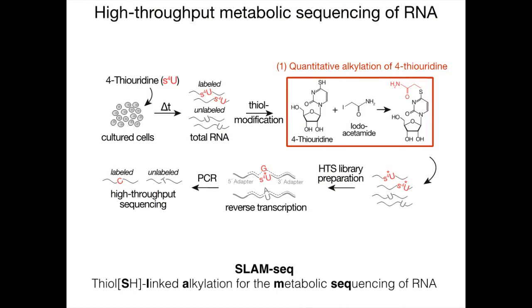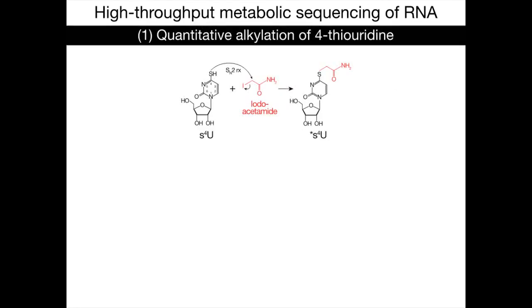First, in order to provide rapid and direct experimental access to metabolically labeled RNA by sequencing, we employed a chemical derivatization approach for 4-thiouridine. To this end, we employed the primary thiol reactive compound iodoacetamide, which covalently attaches a carboxyamidomethyl group to 4-thiouridine by nucleophilic substitution.